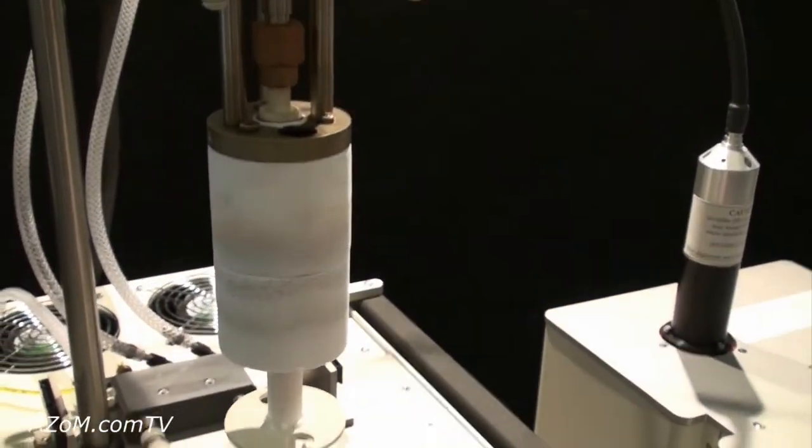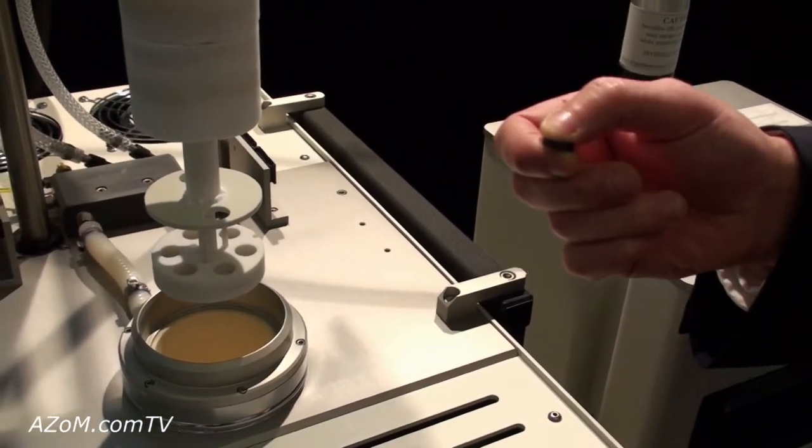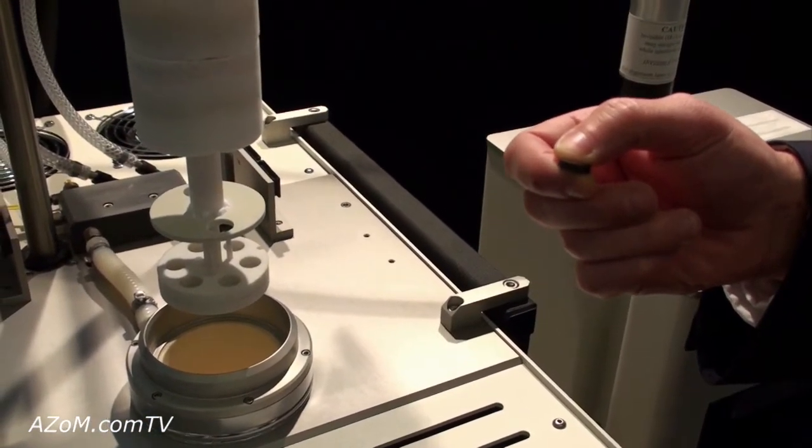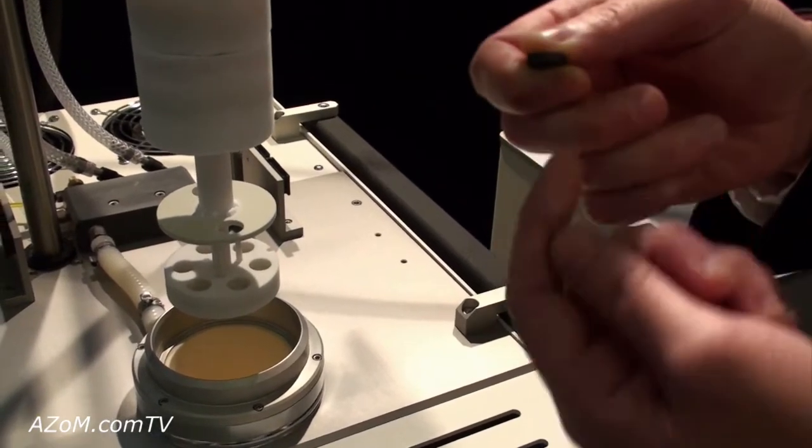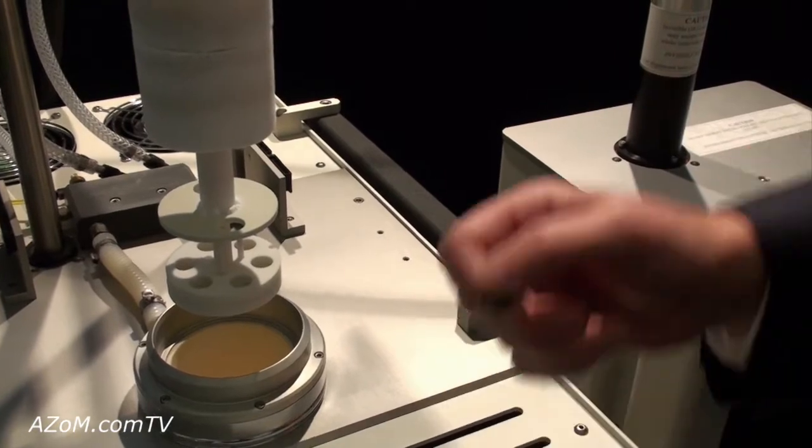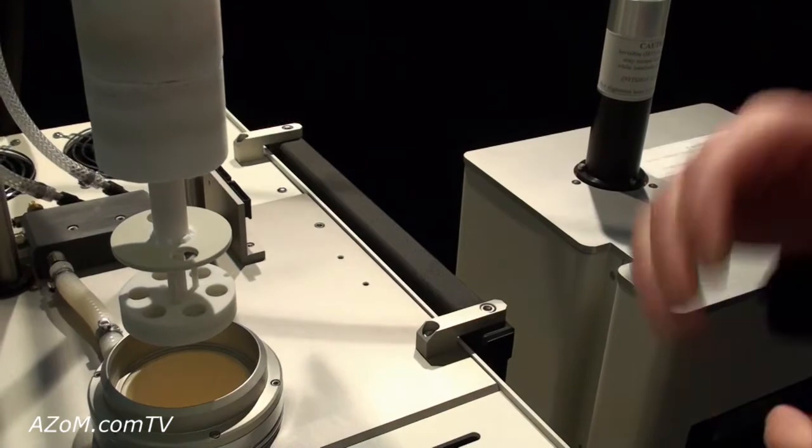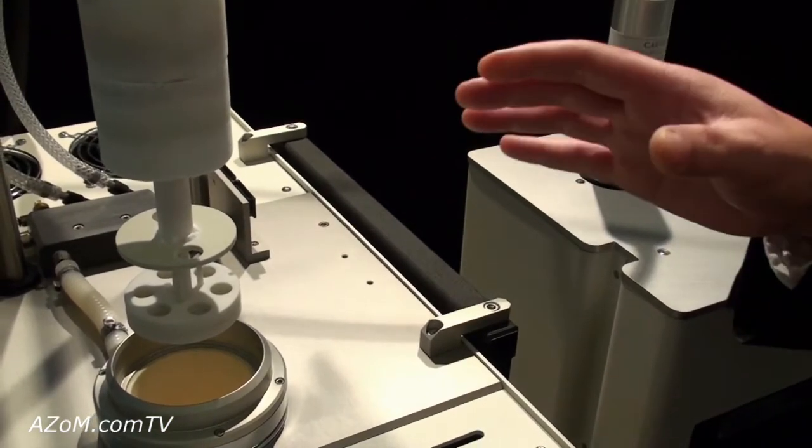On this method, you load your sample, you pick a temperature range that you're looking for, say 1200 degrees C. What you're doing is you're flashing the top side face with a laser pulse from here and you're metering the temperature versus time curve on the back side. From that, you'll receive the thermal diffusivity of the sample.